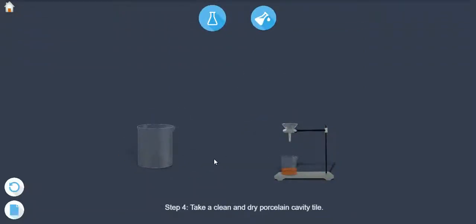Step 4: Take a clean and dry porcelain cavity tile.